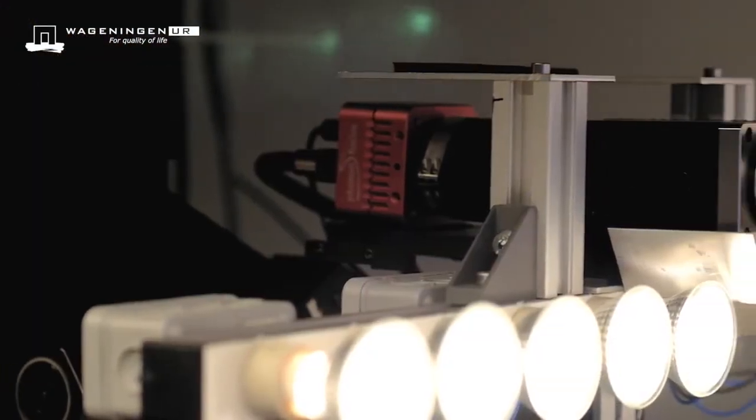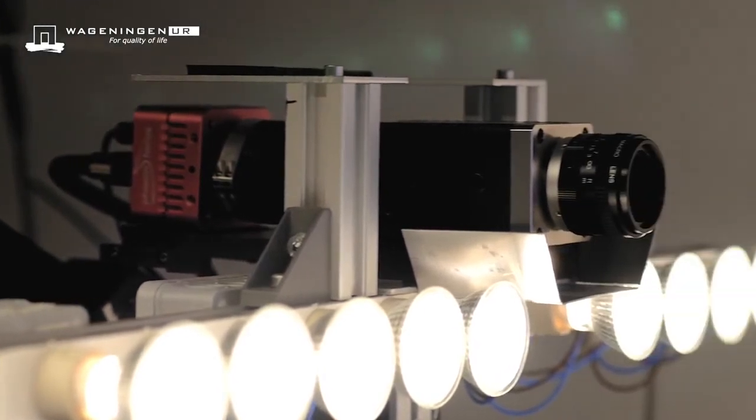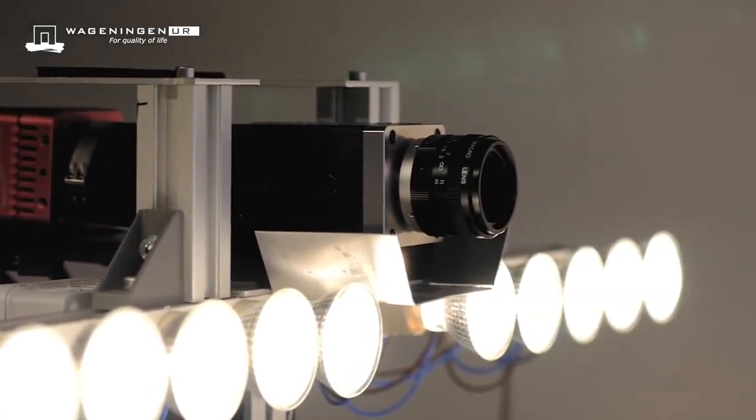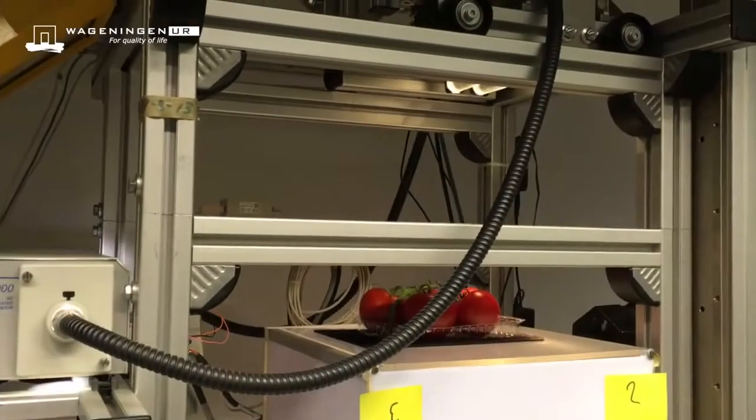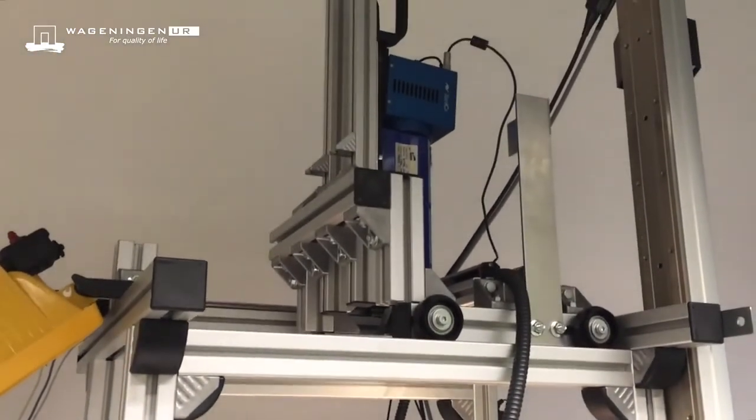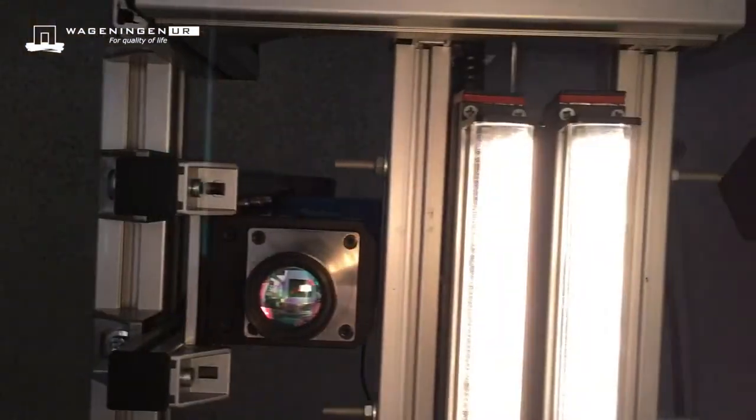Illumination is very important in hyperspectral imaging applications since the imaging spectrograph acts as a line-scan camera. A fiber optic line lighting device with a cylindrical collimator lens is used for top imaging.